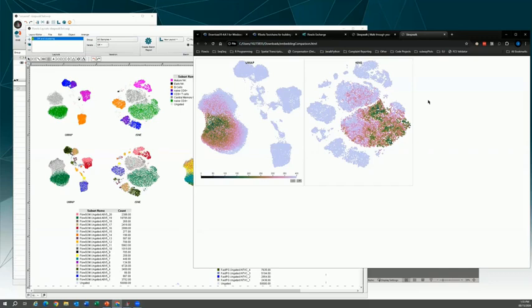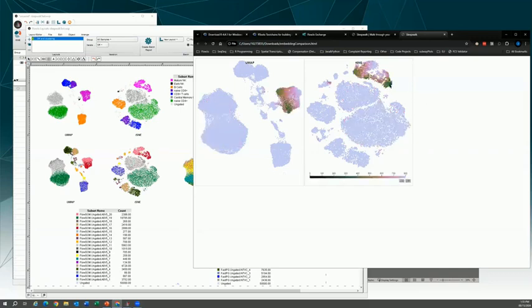So if we go over and look on this t-SNE side, we're in the NK. What cluster is this? It might be 16 and 20. But anyway, in t-SNE space, when I'm hovering over this area of these NK cells, I can see in the t-SNE embedding there's some more definition here, and there's more local structure captured.